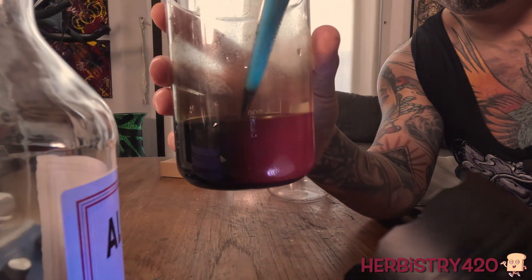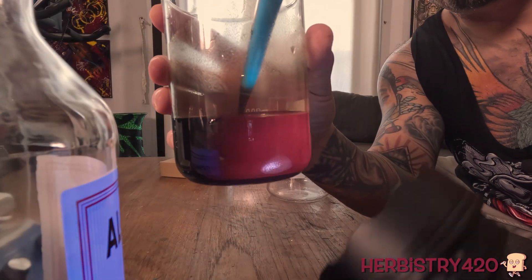I cleaned the flask. Before I show you what the filter cake looks like, let me explain how to determine if there's any chlorophyll in your tincture. All you need is a black light — shine the black light on your tincture. If it glows burgundy red, there's chlorophyll. Here's the tincture right here. When we shine the black light on it, it glows burgundy red. After we filter, it should no longer do that.